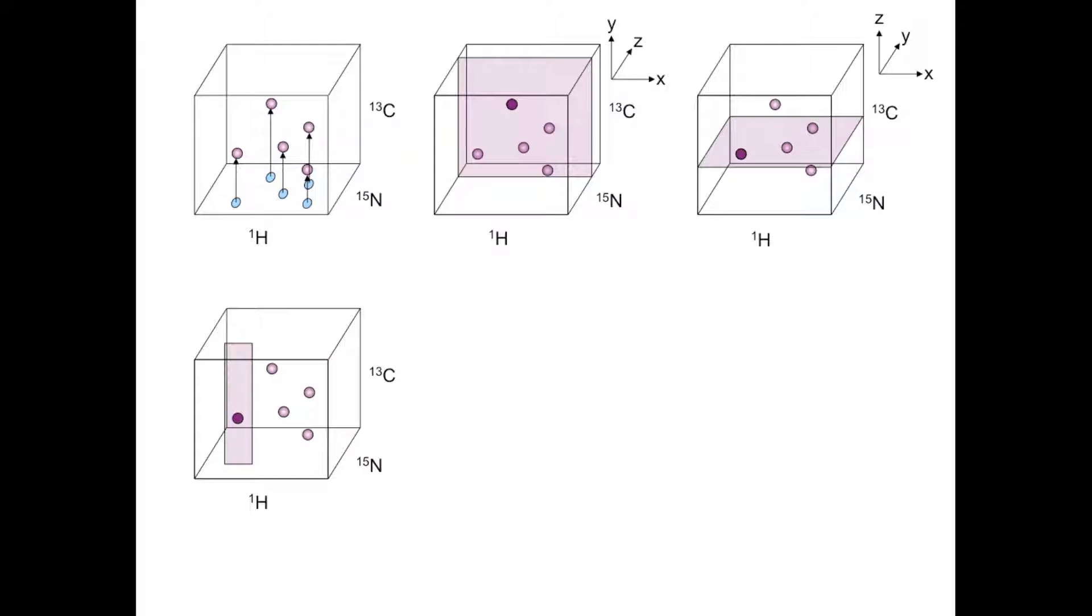If you take several such strips, you can extract them out of the 3D cube and lay them next to one another. Note that while these strips share the carbon-13 y-axis, each strip has its own unique 1H and 15N position along the x and z-axis.